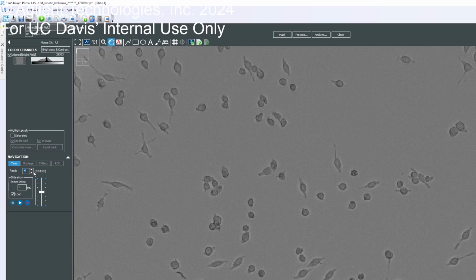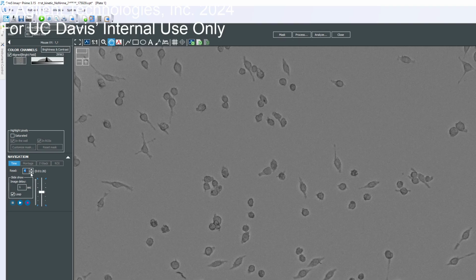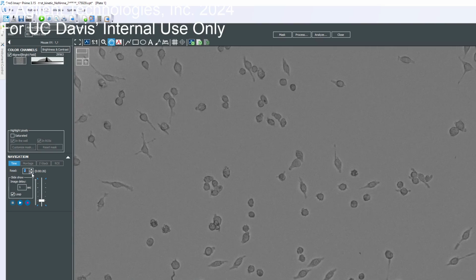You can definitely see a lot of movement there. Those little warped up ones might be them. The irregular shapes might be dead, probably debris, but the circular ones, I don't know what that is. I think that's some debris, but just super dead and floating around.